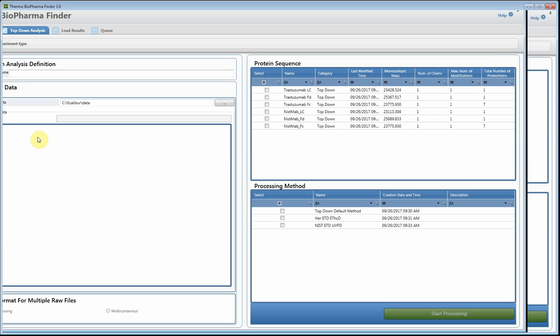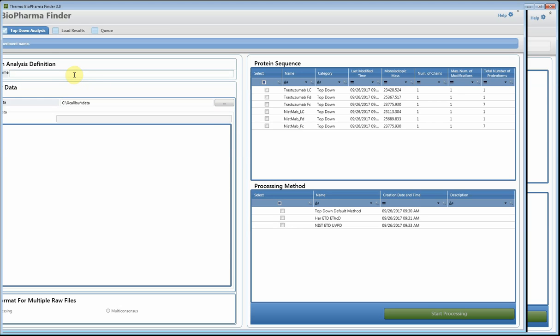If we click on the top-down analysis, you'll see the home page for the top-down workflow, which looks similar to the peptide mapping and intact workflow. In this example, I'm going to show you how we can look at the trastuzumab antibody with an IDES digest — looking at the light chain, the Fd, and the Fc. For the first example we're going to look at one ETD fragmentation raw file, so to begin we'll name our experiment: IDES ETD.